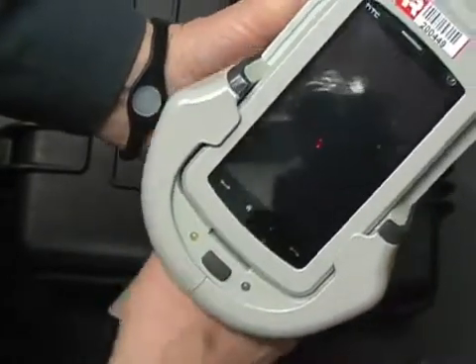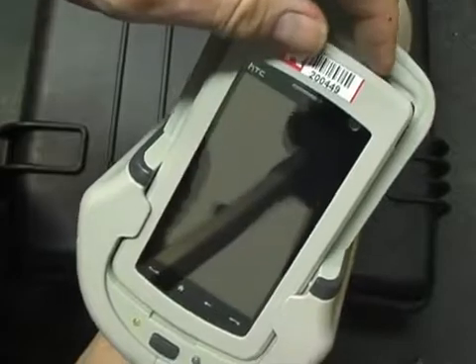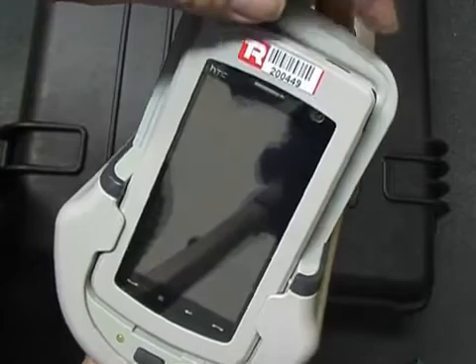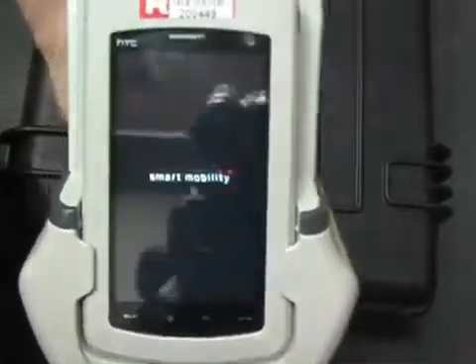Green light. And we turn the PDA on — push that button here. Feel it shake. Now it's booting.